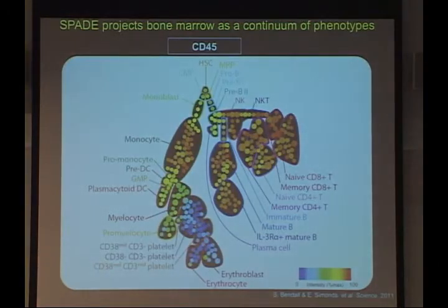But we were fortunate enough to have an algorithm that was developed in parallel with us working on this new instrumentation called SPADE that allowed us to have these dimensionality reduction visualizations. So just take it for granted that what SPADE was able to do is take the really high dimensional single cell measurements and distill them down into a two-dimensional scaffold that we could then use to browse our data. And the cool thing that I really liked about SPADE is you didn't have to know the cells were there to begin with, because every cell in your experiment that you gave to SPADE got put into one of these nodes. So each of these nodes represents a cluster of cells.